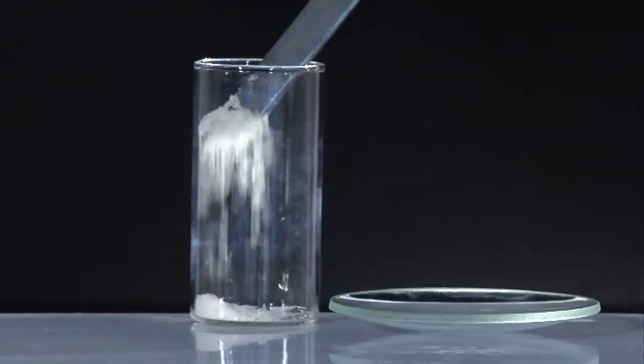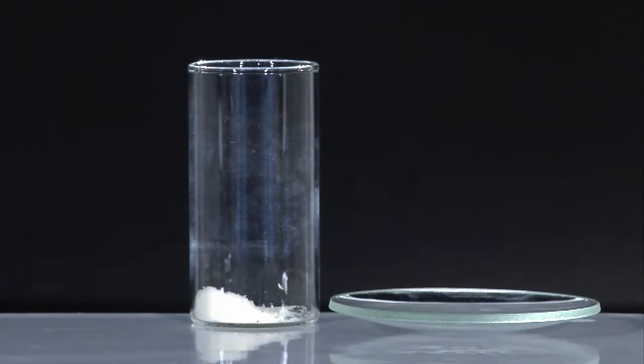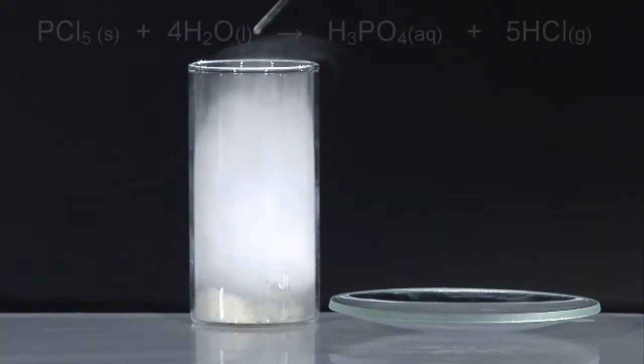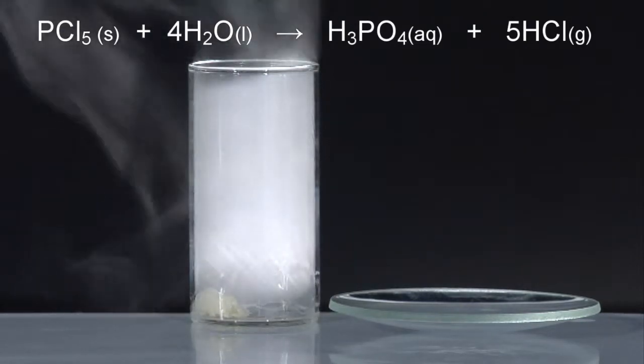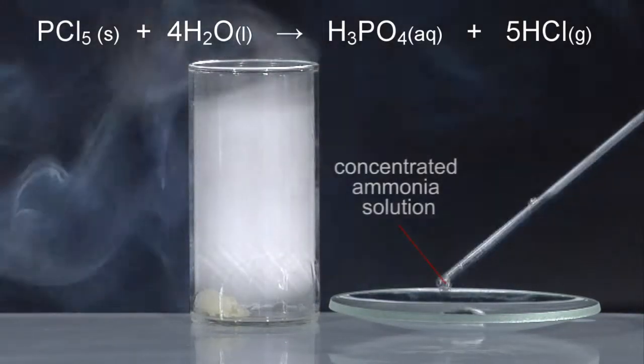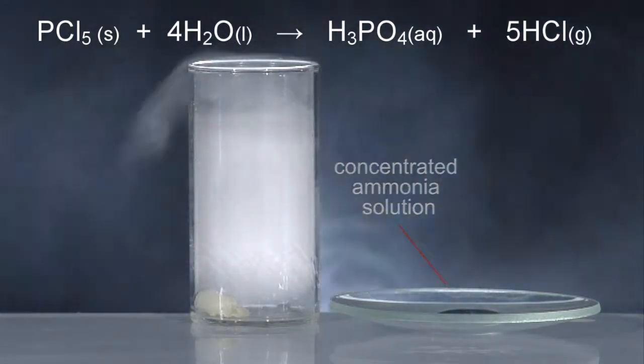In this second test, a few drops of water are added to some solid phosphorus pentachloride and then concentrated ammonia solution is placed in the watch glass just to the right of the sample tube.